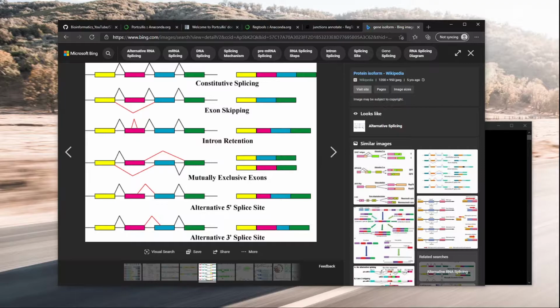But anyway, the thing that we want to find is, okay, there are already all of these junctions that are identified in the GTF file, which is great. But we want to find potentially new junctions that, in the case of today, with the musculus RNA sequencing file, are potentially more related to what we had done as a treatment and not necessarily in mice in general. So the GTF is probably just generic, but if we're going to irradiate the mice in our sequencing experiment, this might identify junctions that are particular to irradiation in either p53 knockout or p53 positive, wild type mice.